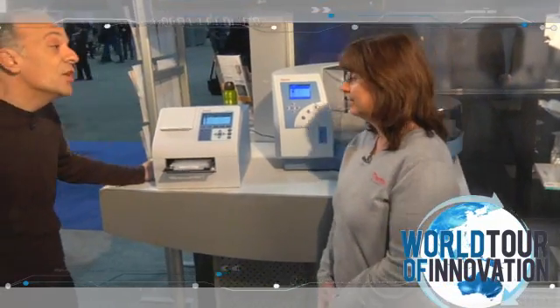We're back with Michelle Smith, our application specialist. Tell us about the Thermo Scientific Multiscan Go.